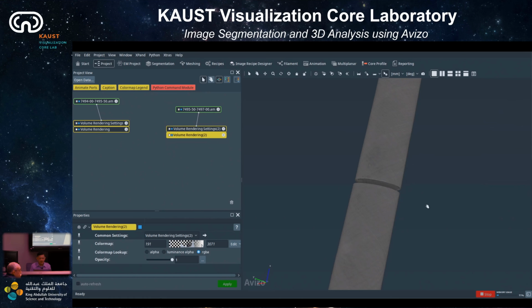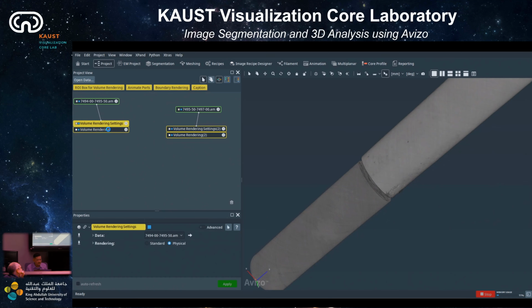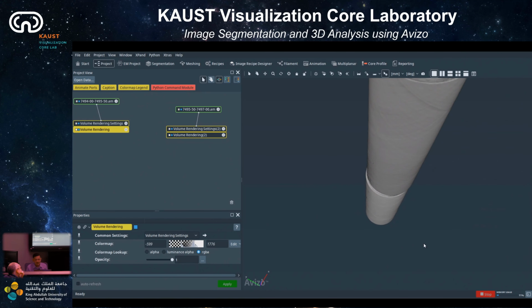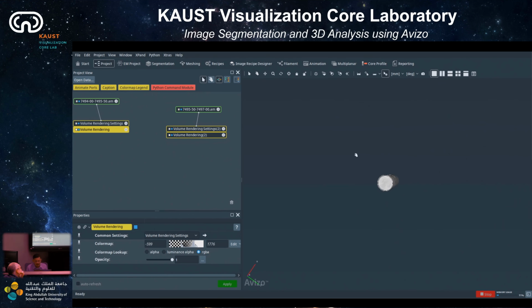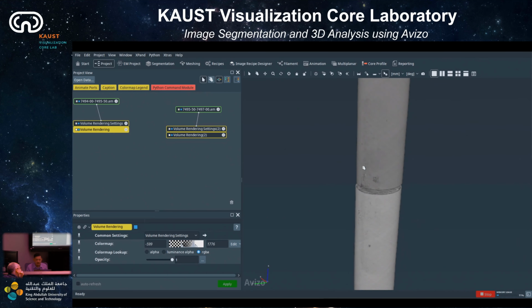So what we're gonna do here, we're gonna do image registration. You can select one of the cores to start to modify them. So I visualize them like this. Let's say I will start from the one at the bottom. It doesn't matter which one, but I think they are already very close. You just need to align them very well.